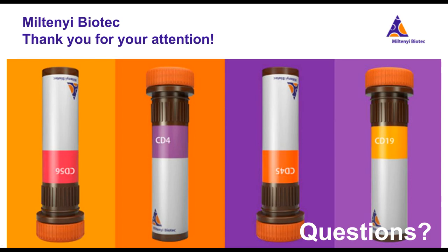You may have background that originates from dirty samples, like samples from the gut origin, which contain some debris and stuff. I think it's not going to work for these kinds of samples. But when it comes specifically to background that you expect to come from Fc gamma origin, obviously this will work. I hope that answers it.